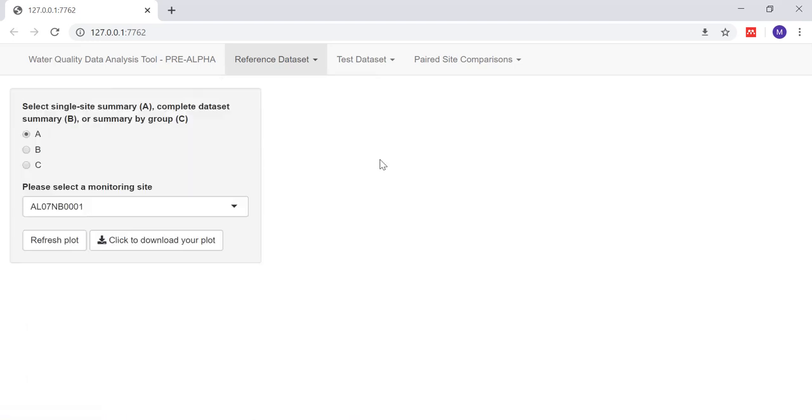This page also generates graphs, but it focuses more on the dates of data collection. If you're looking to see what times are sampled more than others, or you want to get an idea of what your period of record is, or if you just want to brag about how much data you've collected, this is probably a good tab for you.